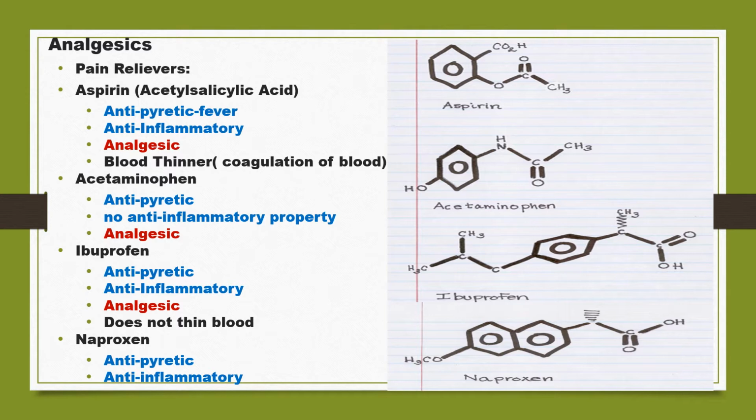And because they have different functional groups as well as some common functional groups between them, you can see they have common medical actions as well as distinct medical actions. Anyway, in this experiment we will be looking at the synthesis of one of these drugs, and we will take aspirin as the focus of our study.